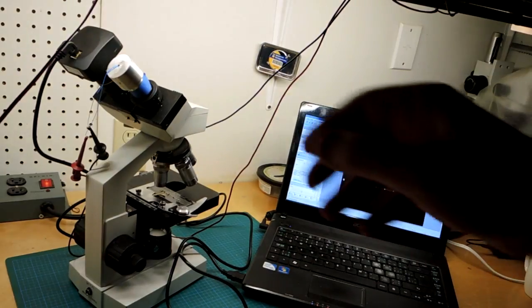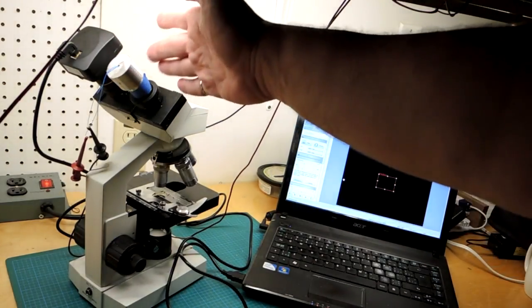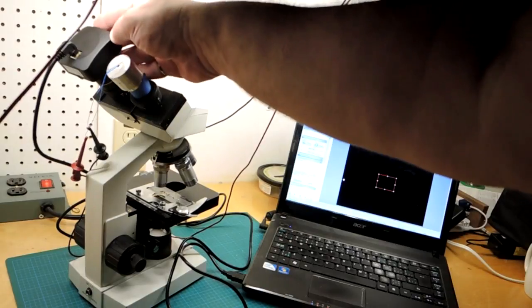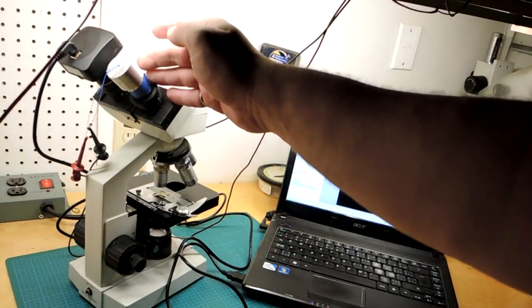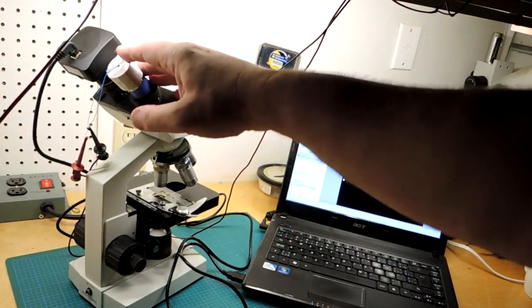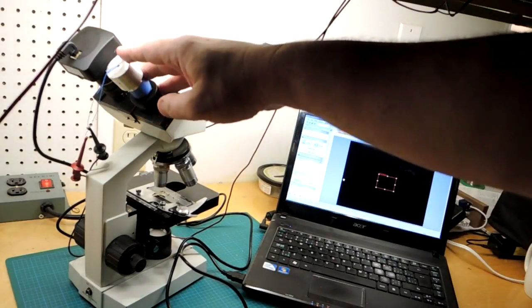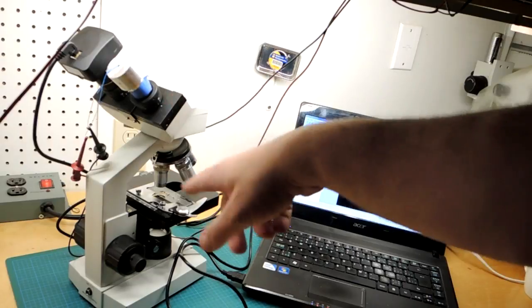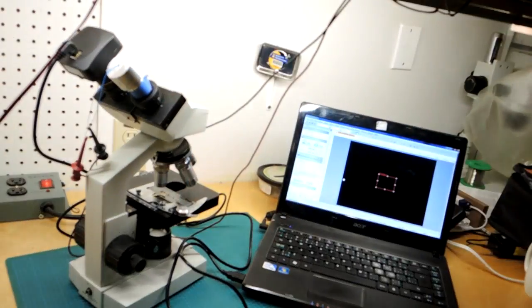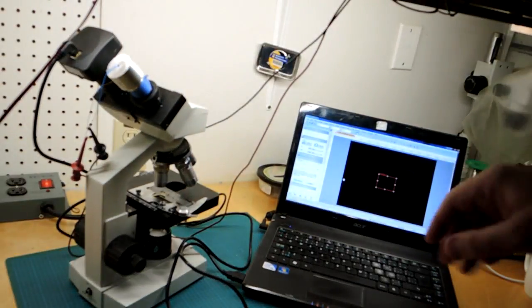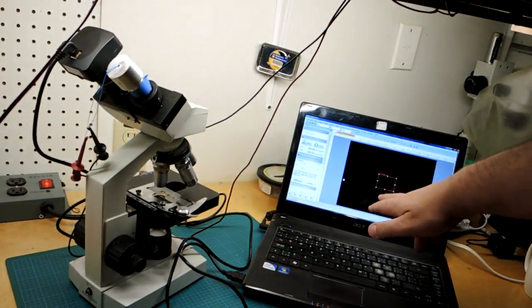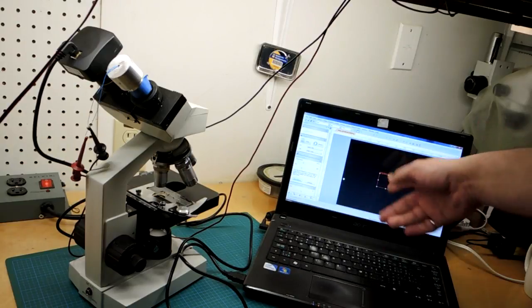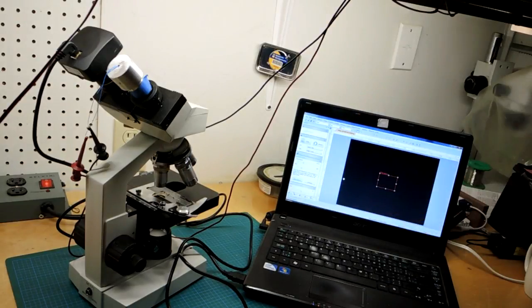Okay so here's the final setup. A binocular microscope. One eyepiece has a digital camera into it. The other one has this new top side illuminator that I just created. On the slide there I have an integrated circuit and this is the view of the camera application which will display the die.